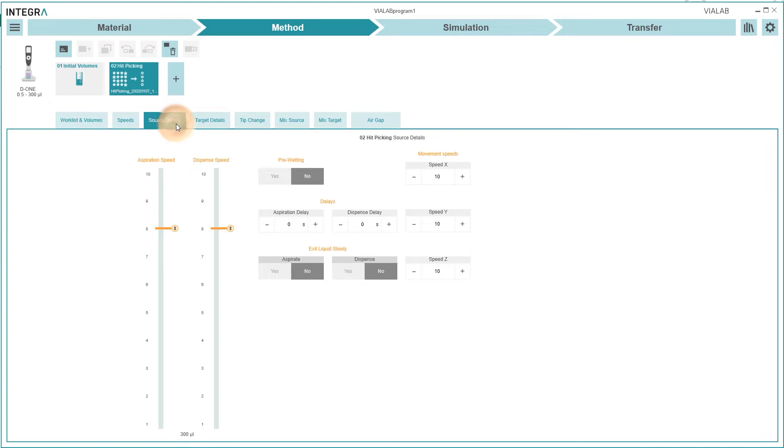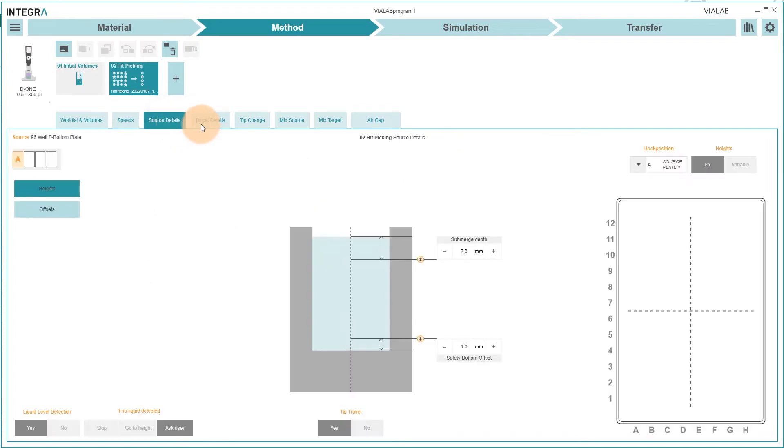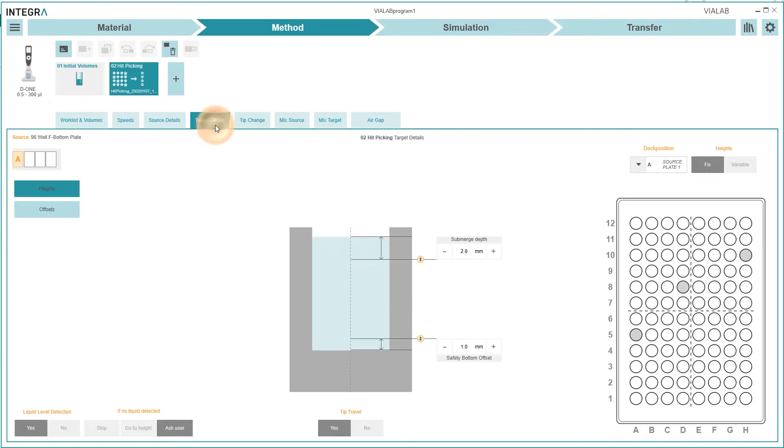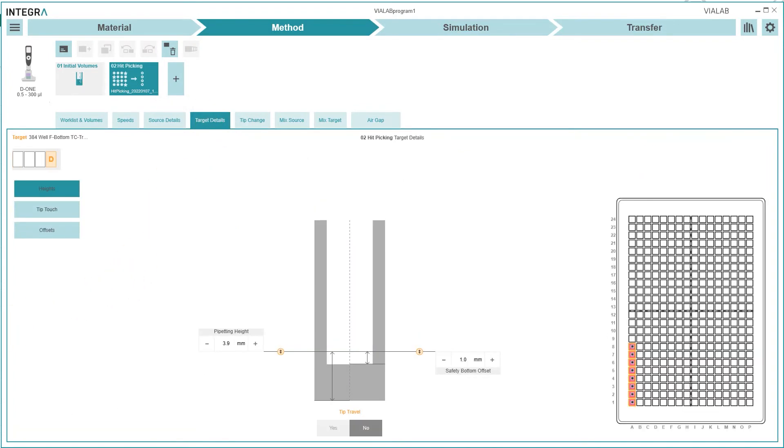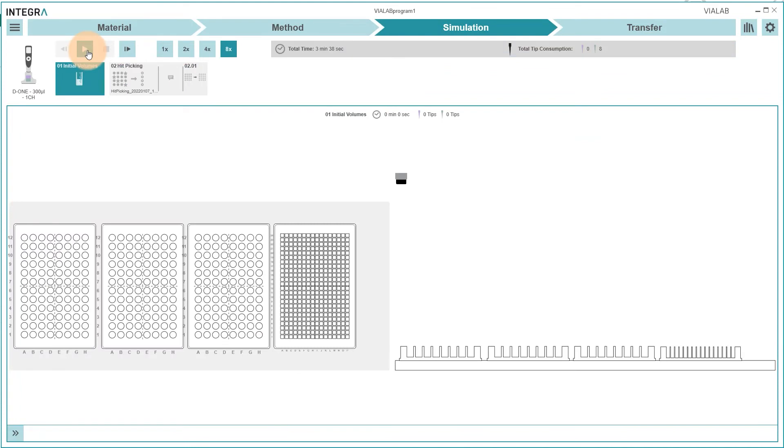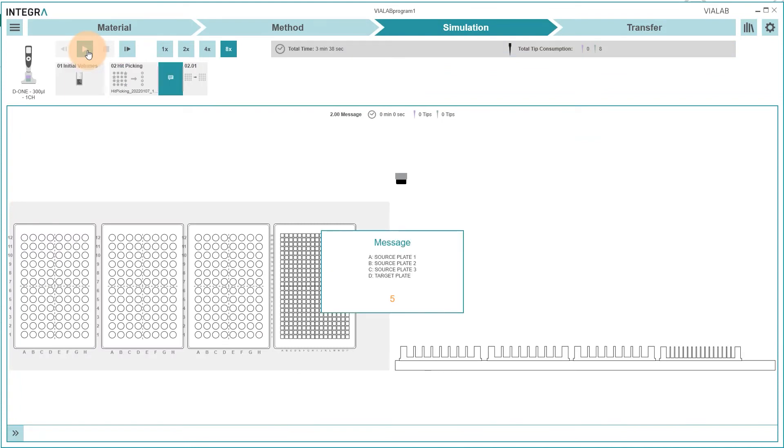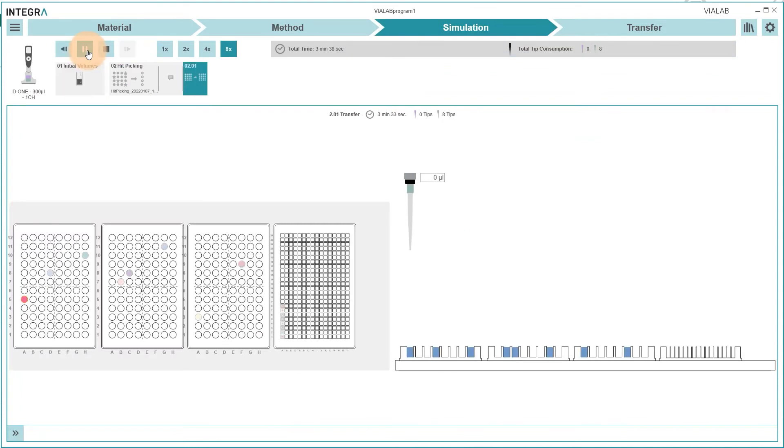Additional parameters such as Pipetting speeds or Pipetting heights can also be adjusted. In the simulation tab you can check the previously defined program again before going to the transfer tab.